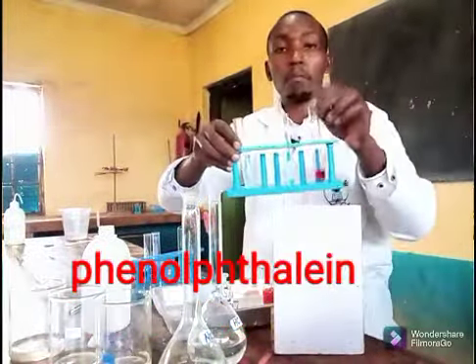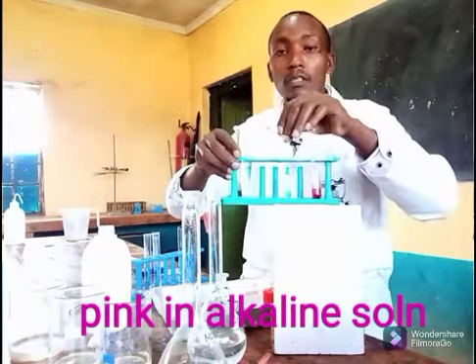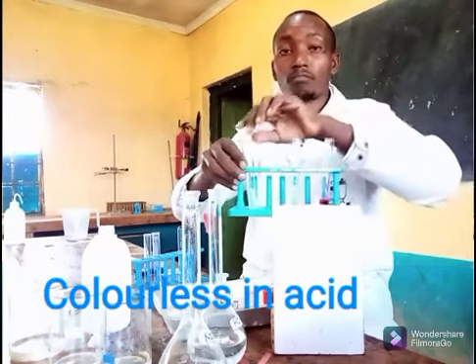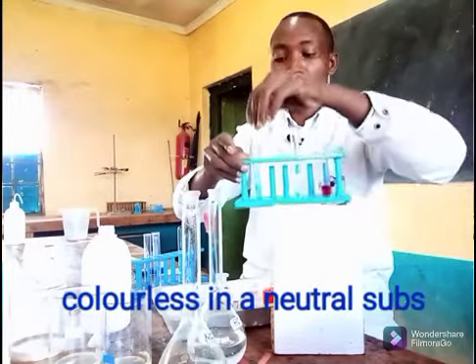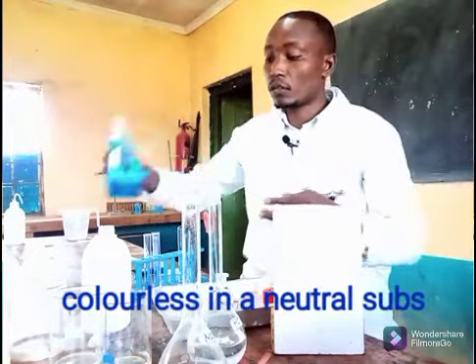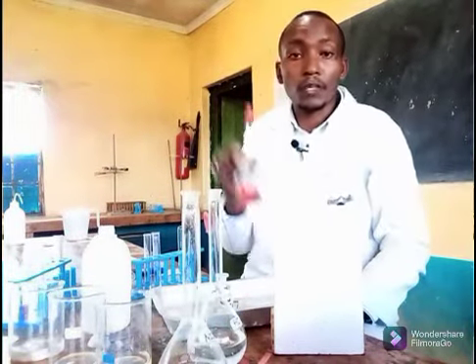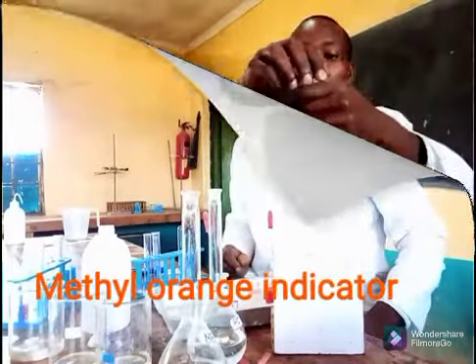What does that mean? Phenolphthalein is pink in an alkaline solution. It is colorless in an acid, and again it is colorless in a neutral substance. That one we've used phenolphthalein. Next, we use the methyl orange.